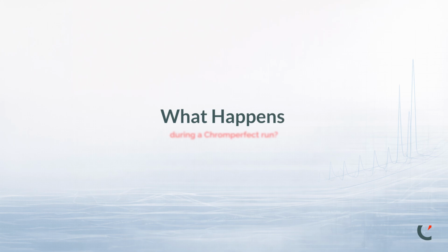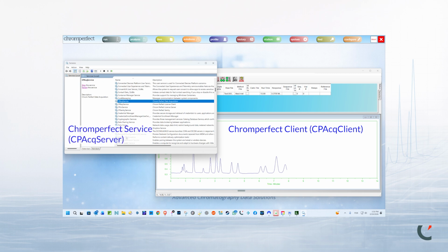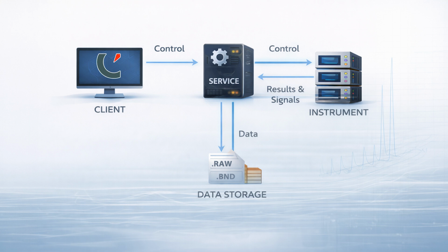What happens during a Chromperfect run? When a run is started, the client sends the active method and instrument control instructions to the service. The service communicates with the instrument and begins data acquisition. Acquired data is written to disk as raw data files. Later, that data can be processed and saved as BND files. File structure and data processing will be covered in later modules. For now, focus on the direction of control. Client to service, service to instrument, instrument back to service, service to data storage.